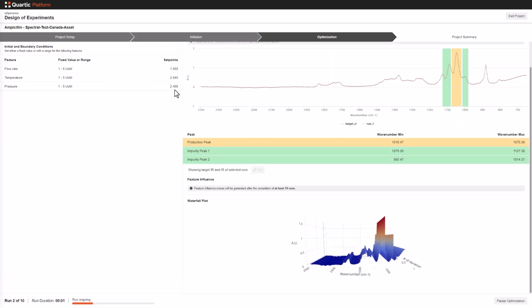In this environment, we have a digital twin running in the background. So we can quickly iterate through multiple runs without needing to wait for actual lab-based experiments to be run. So if you have, or we can help build a digital twin for your process, then we can augment physical lab-based testing with in silico modeling. Essentially digital experimental runs, which will further accelerate this PD timeline and minimize the number of experiments that need to be run in the lab itself.